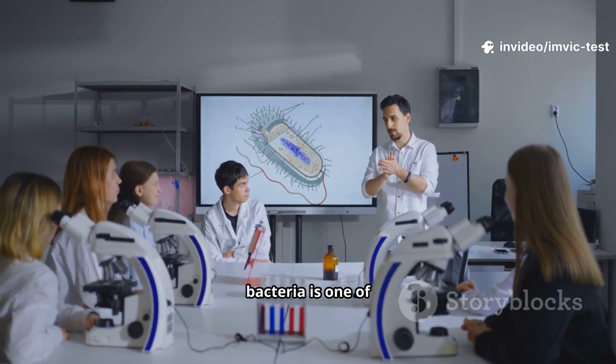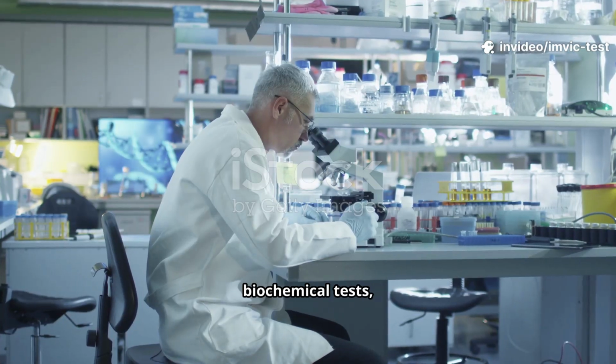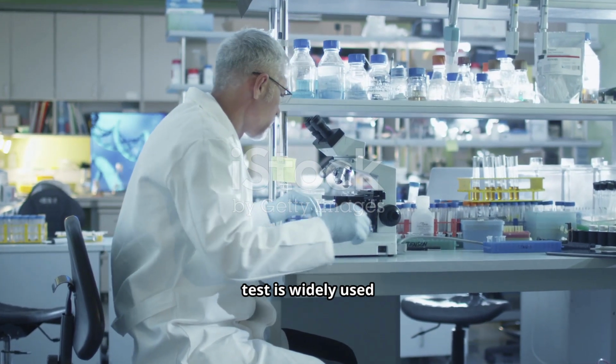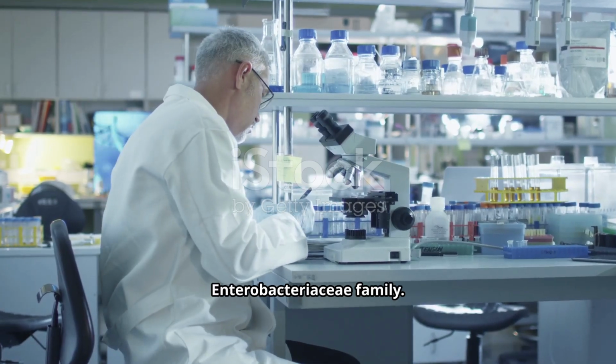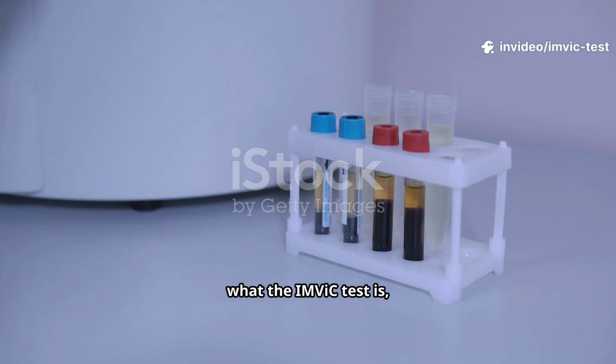Identifying bacteria is one of the most important tasks in microbiology. Among the many biochemical tests, a classic group known as the IMViC test is widely used to differentiate members of the Enterobacteriaceae family. In this video, we'll break down what the IMViC test is, how it is performed, and why it matters.